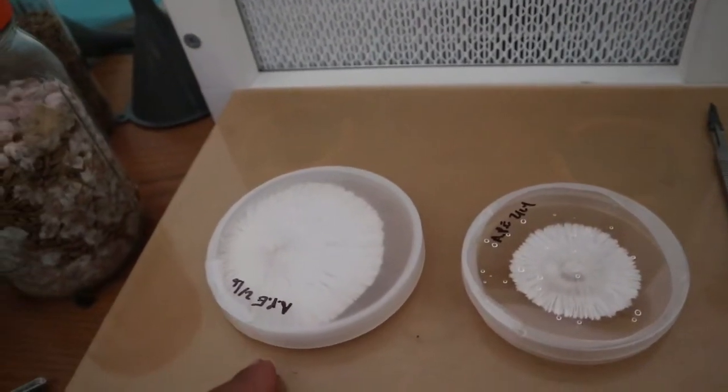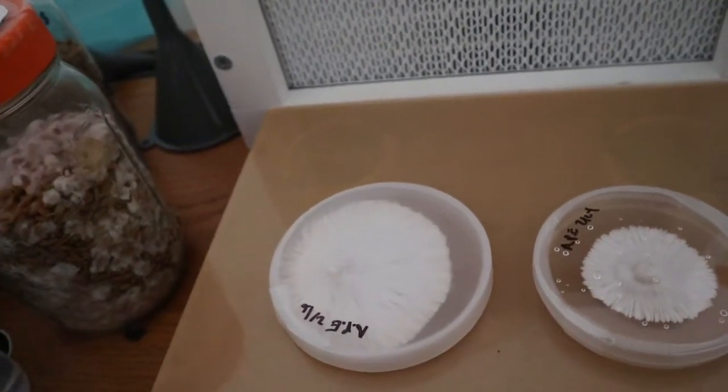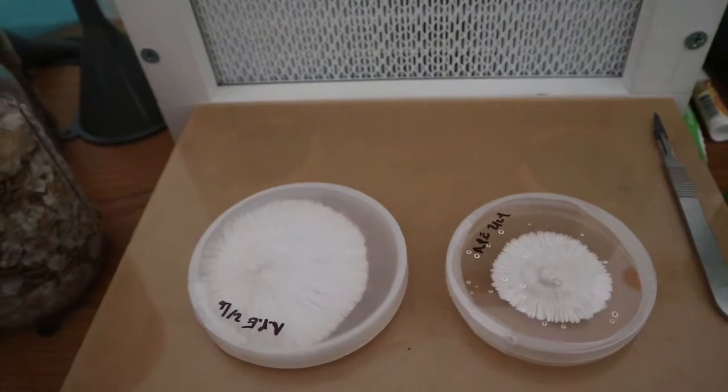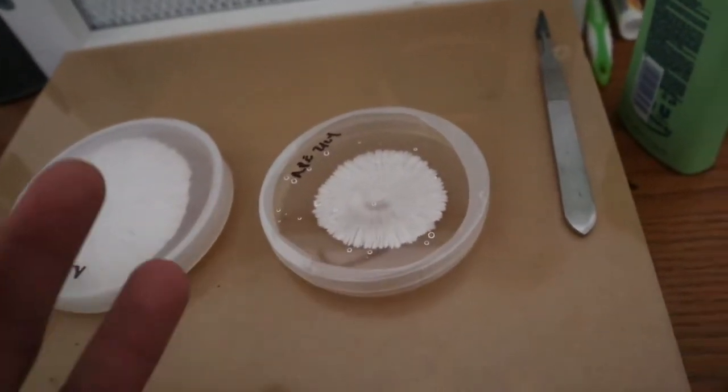I'll start with the pros for this one. The pros is you can reuse them and you don't have to throw them away, so you're not making more plastic waste. As opposed to this one, you gotta throw them out, you gotta toss them out after you use it.